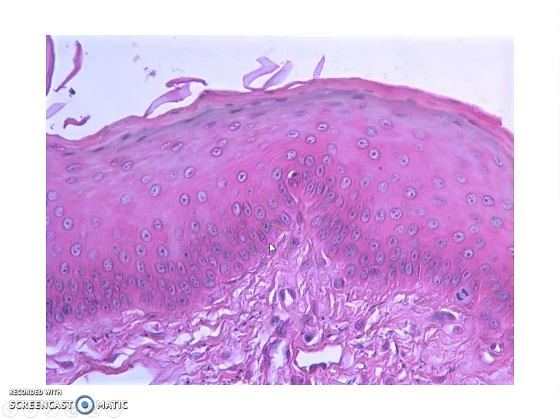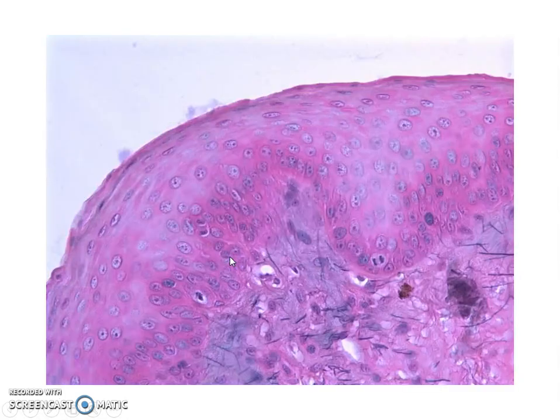What happens with stratified squamous epithelium is that the cells that produce all the other cells of the epidermis can be thicker. They can almost be cube-like or column-like. And as mitosis occurs, these cells are pushed superficially, they become squamous, or they become flattened. So by the time we get to the superficial surface right here, we have stratified squamous epithelial cells that are really thin, and the deeper cells can be thicker. And here's another example of stratified squamous epithelium in our skin, mainly thinner superficially, and some of them can be thicker, deeper.